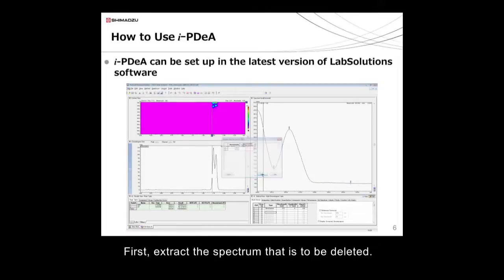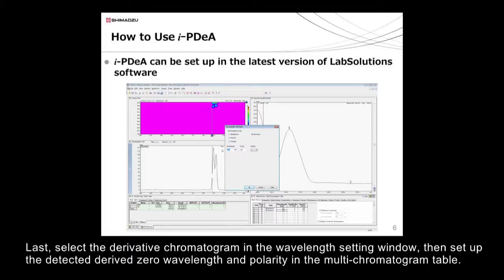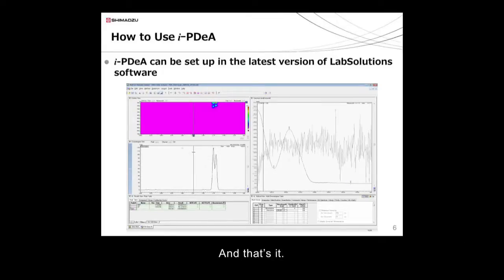First, extract the spectrum that's to be deleted. Next, implement the first derivation using this spectrum. Last, select the derivative chromatogram in the wavelength setting window, then set up the detected derived zero wavelength and polarity in the multi-chromatogram table. And that's it!